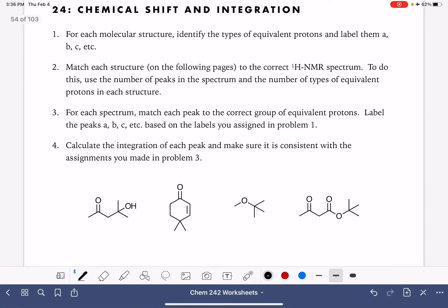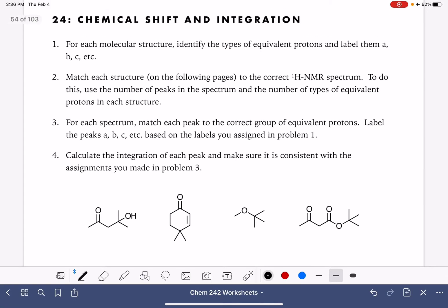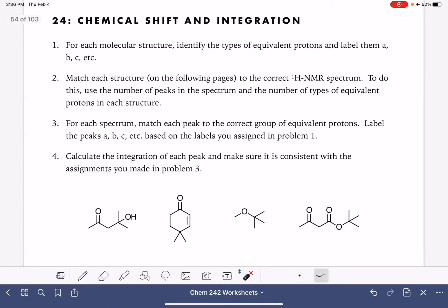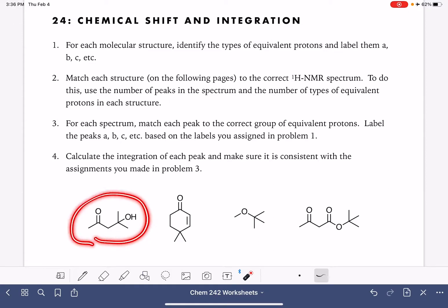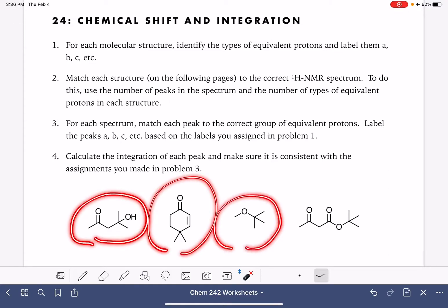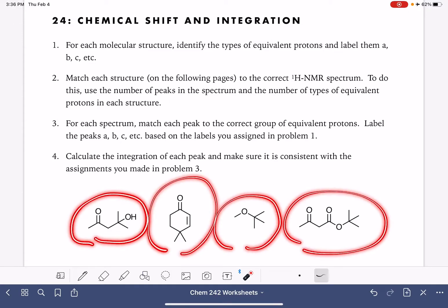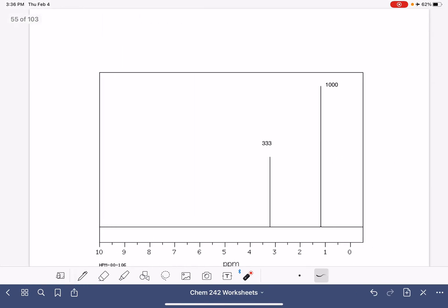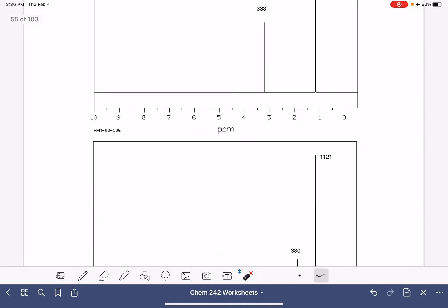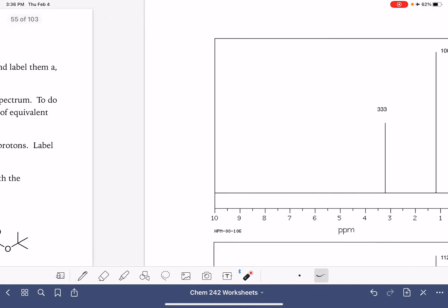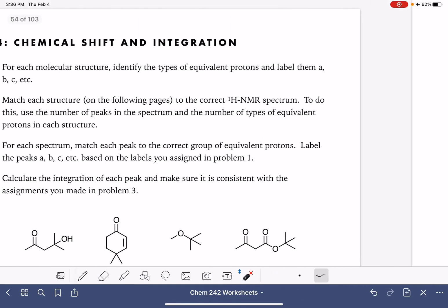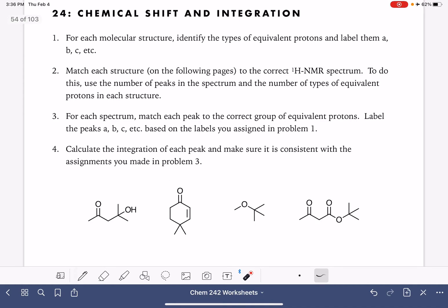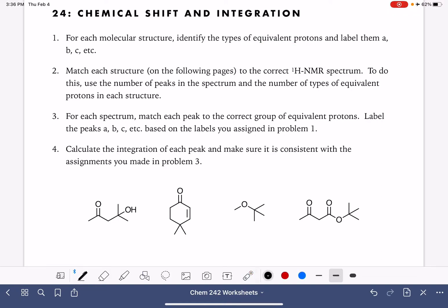In this video we are going to analyze the NMR spectrum of four different molecules. We have four proton NMR spectra and we're going to match the molecules up to each spectrum and analyze the different features. We'll start by identifying the number of equivalent protons in each molecule.